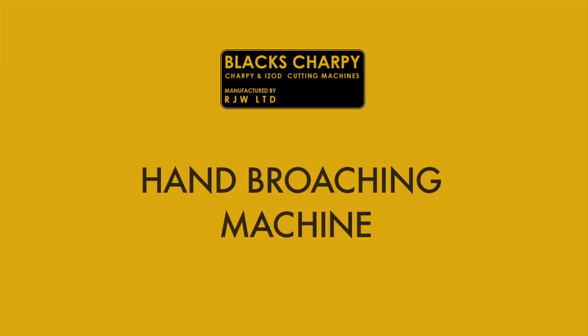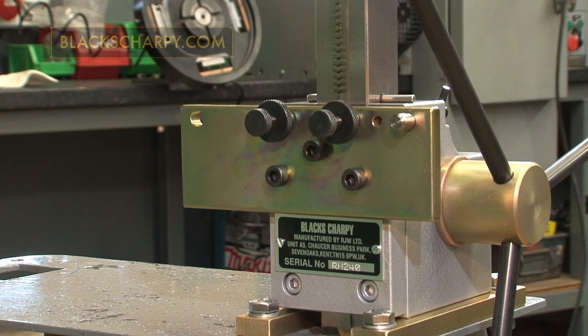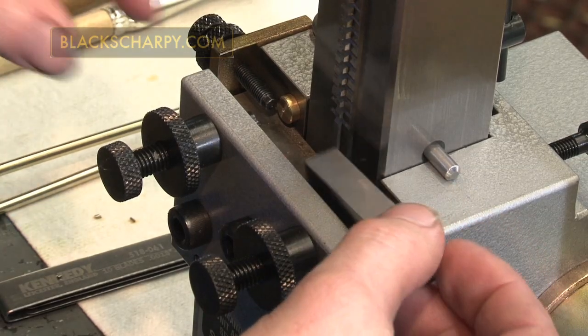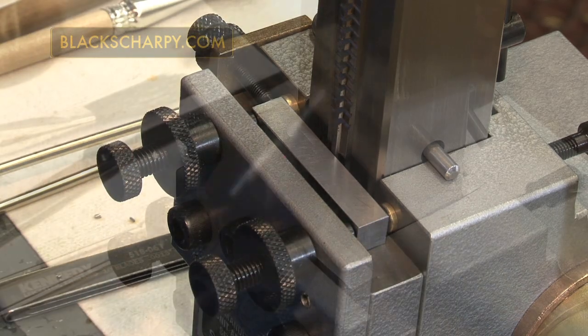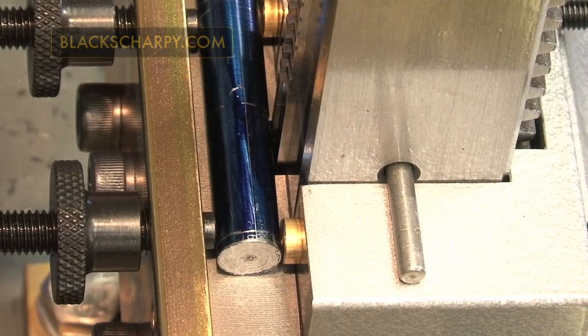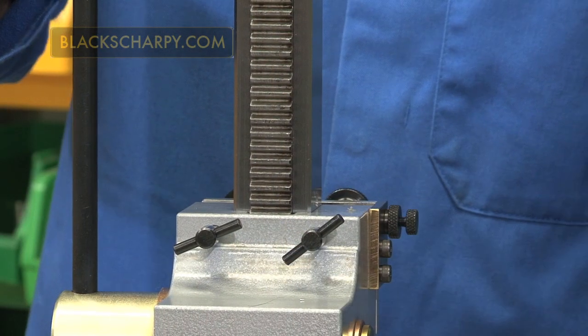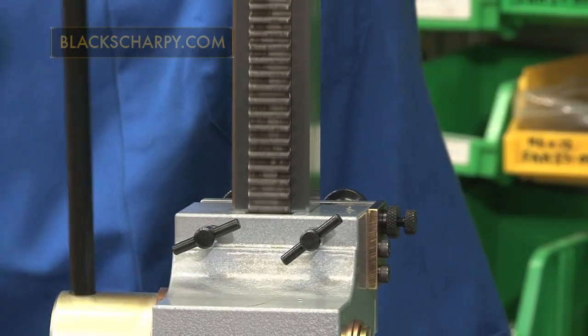Thank you for taking the time to look at this video, which shows the operation of our Charpy and Izod hand broaching machine. Our hand machine is designed to be mounted on a customer's own bench, and is designed for cutting Charpy and Izod V and U notches in pre-machined standard 10mm square, subsize and 0.45 inch diameter specimens. We will now explain the setting up and broaching operation of a 10mm square specimen with a 2mm deep V notch.